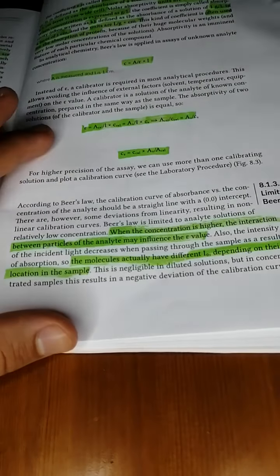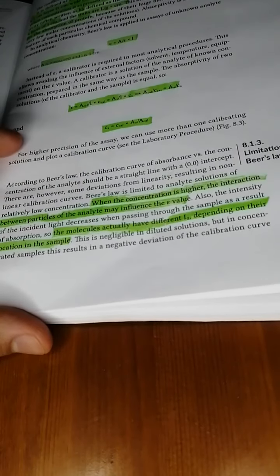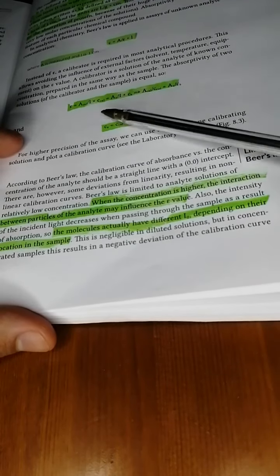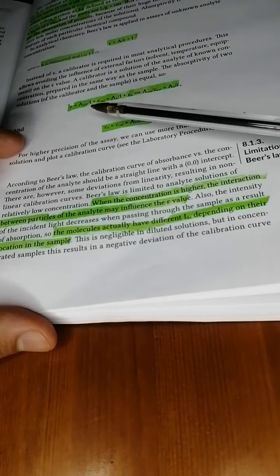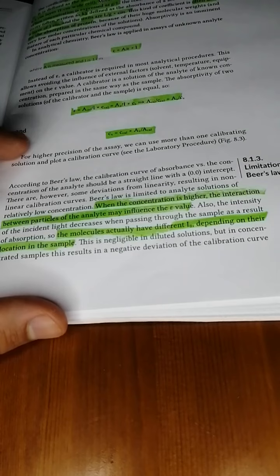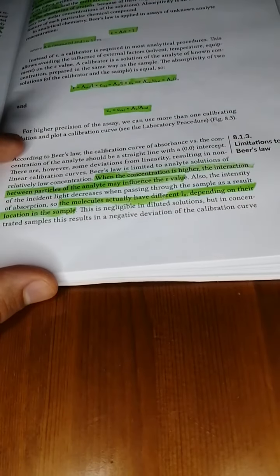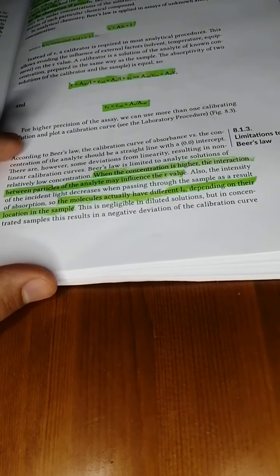So yeah, this is also another way to figure out the concentration, using the concentration and absorbance of another solution with the same molecules in it. Okay, so Beer's law is great, but it does have some limitations.